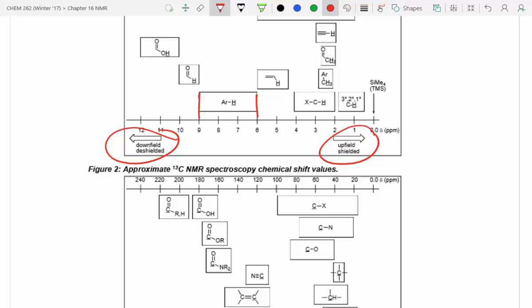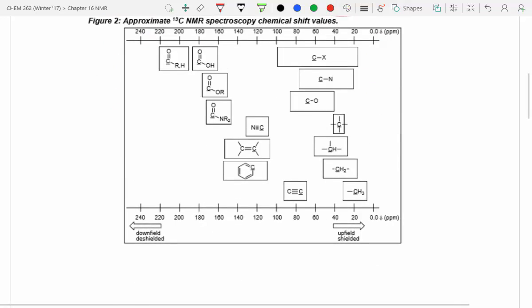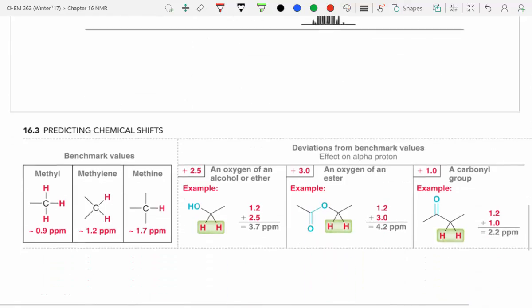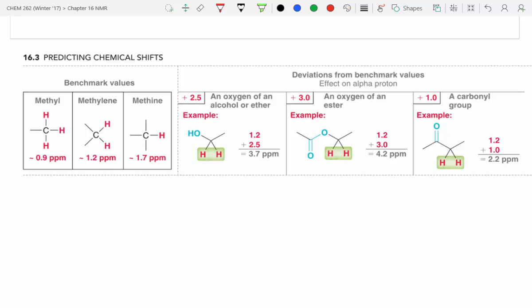On the table at the bottom, all the way down, whichever one you just showed us. Yeah, that one. He was saying that if it's another carbon over, to do 1/5 of whatever that value is. Does that still work? Yeah, you can.